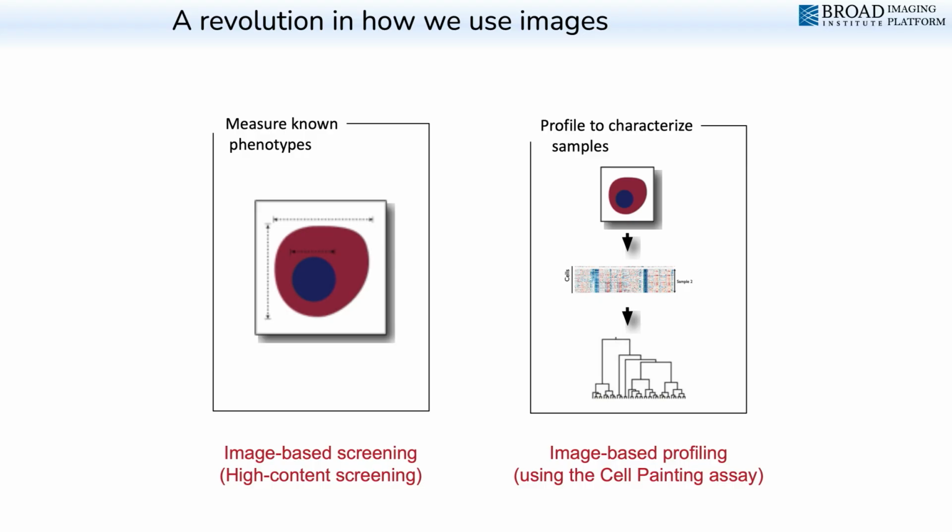So all these examples, you just want to think about this a little bit, right? All these examples I showed you of these biological images where we have specific phenotypes we want to look at, or specific examples of cells we want to look at. In all those cases, we as biologists are going in with a predetermined thing that we're looking for, either something we can directly tell as to what we're looking for, or examples of it, right? But we can take a very different approach too with images. Images are a rich source of information, and you can take a more unbiased approach.